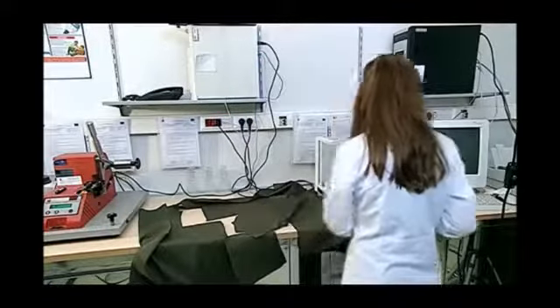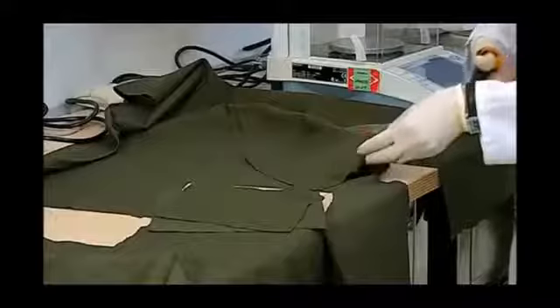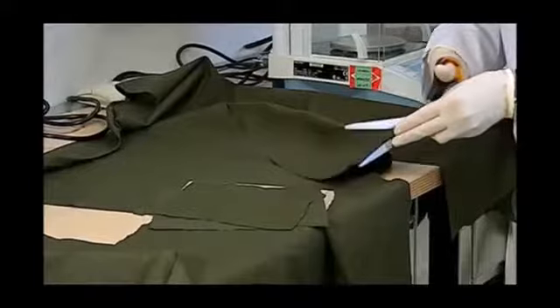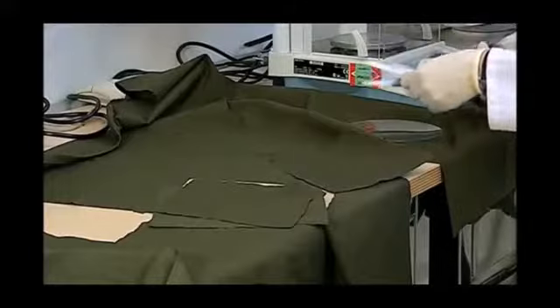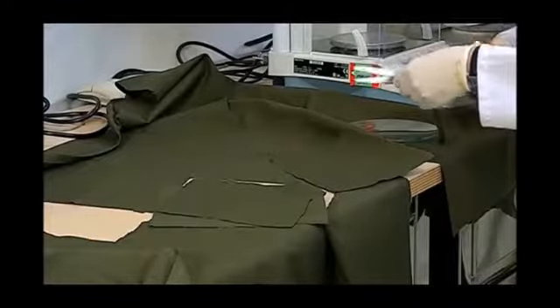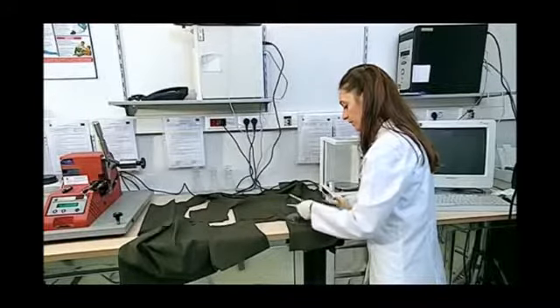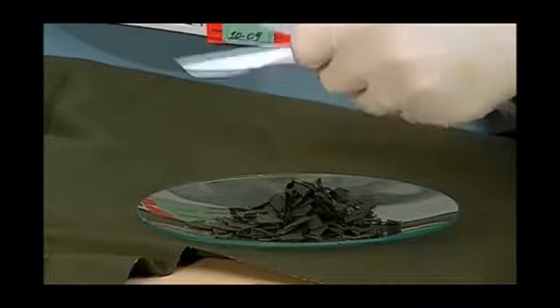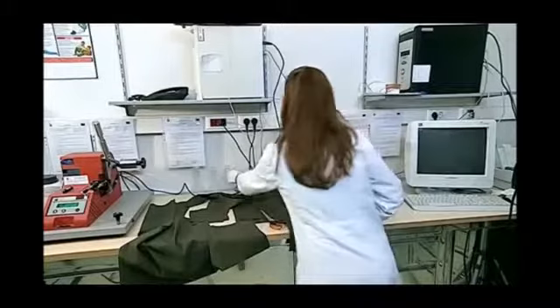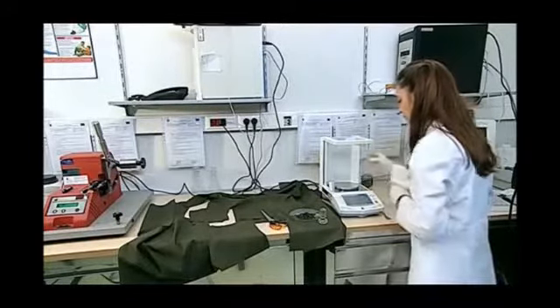Now, I take the first of 3 pieces that we have cut off, and I cut them again into small pieces which must be not bigger than 0.5 centimeters. We mustn't forget to wear gloves so that the samples are not affected by any sweat. The samples cut in this way, which are considered as 2 grams, are put on the conical flask scale for exact weighing.